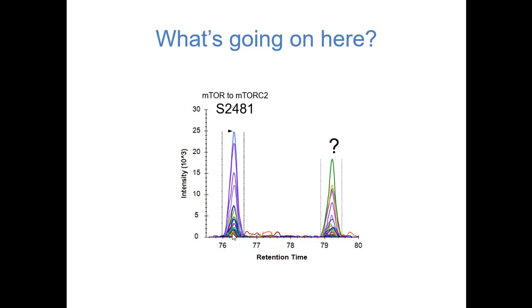For a couple of reasons, but I think the primary one is, it would make sense that your low abundance ions are going to have less mass accuracy, right? Because you have fewer points to figure out what the actual mass of that peak is, right? And so low abundance ions are potentially the ones that are going to get shifted out first. That's what you would assume, right?